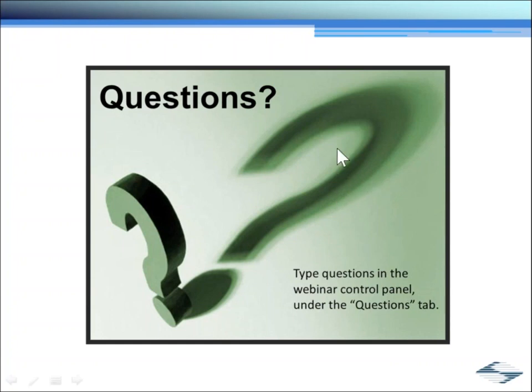Check to see if there's any more questions. So Jeff, one of the things that I was very curious about was the increase in the use of 3-photon imaging. This is something that's really fascinating, but I always assumed that it wouldn't be very useful because of the very, very low probability of getting 3 photons absorbed in a fluorophore within the focal volume within a sample. What is it that's making this possible now?